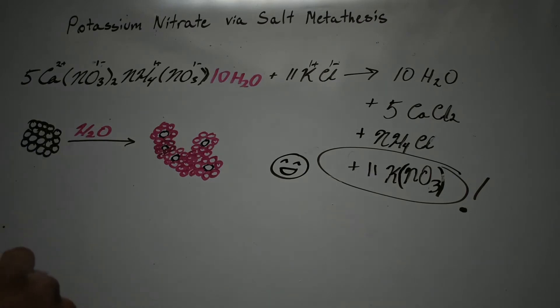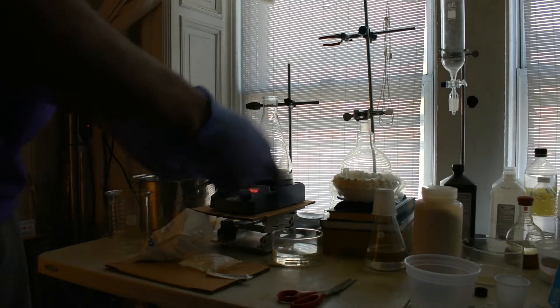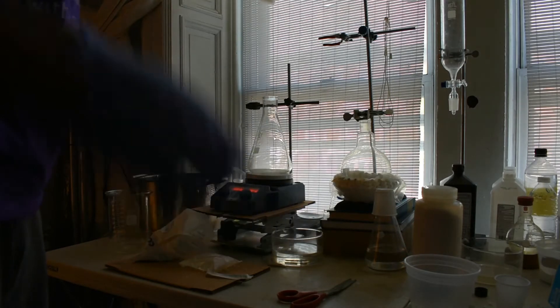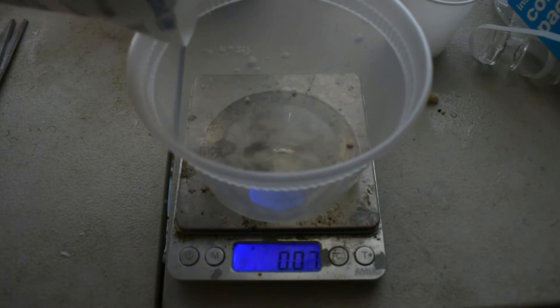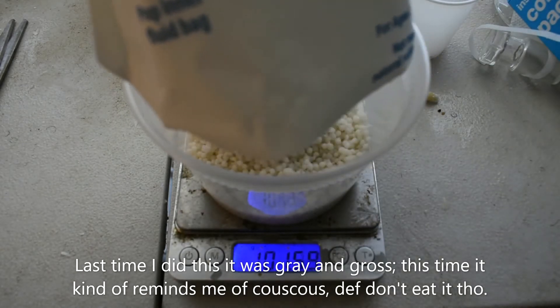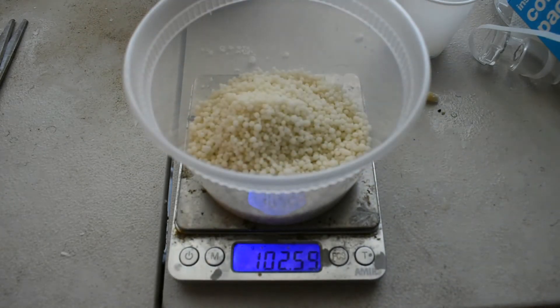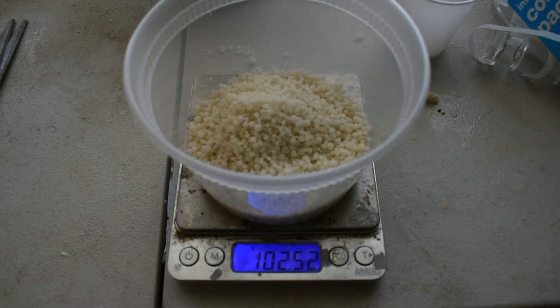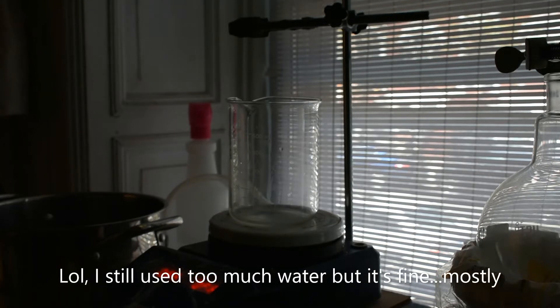Alright, got the cold pack cut open, got the water bag out, and now we're going to weigh it to see how much we're starting with - that'll tell us how much potassium chloride we need. Let's see how much of this calcium ammonium nitrate we have - about 100 grams. I'll change to a beaker here because it's cleaner and I probably won't need as much water.